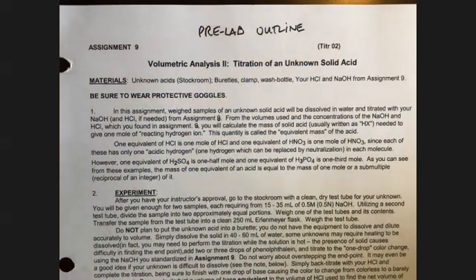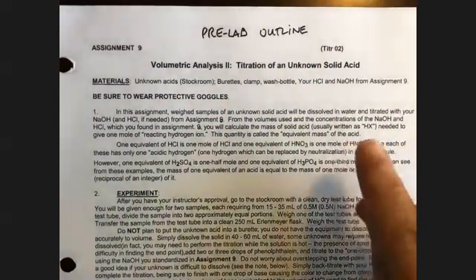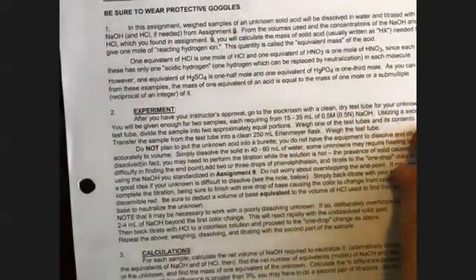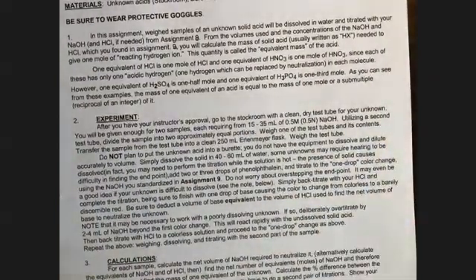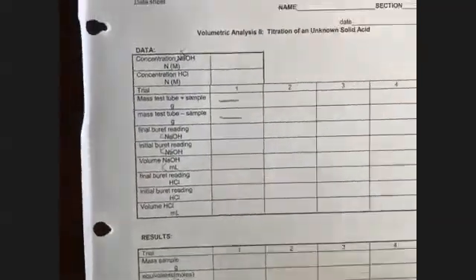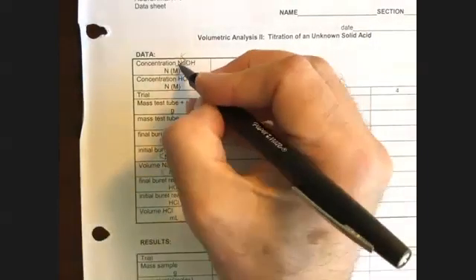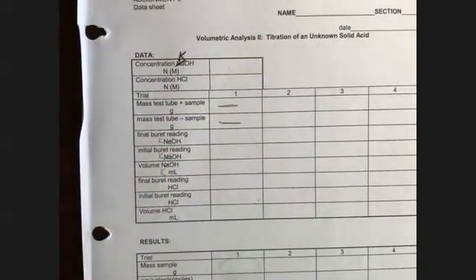That is not going to be the case, but you still are responsible when you submit your lab report for including an outline. Now, what's good about this is that we're going to make some changes here in the way the experiment is done. Let me show you the data sheet for this and show you what they're doing here. Okay, this is the data sheet here. First of all, this experiment was designed for you to use a solution of known molarity of NaOH. And as you can tell here, we're not doing that, we're doing KOH. Right? Now, notice the following.